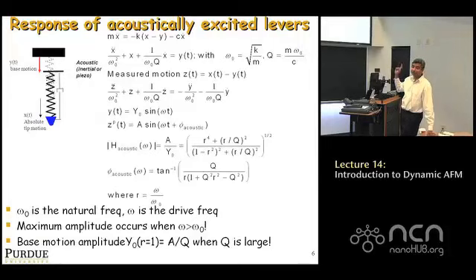I have not said that yet. Right? So the shaking that we do need not be at the natural frequency. It can be off, it can be slightly greater, it can be slightly below. I have not said that. But the key point is that the cantilever now responds at the frequency at which you're exciting.